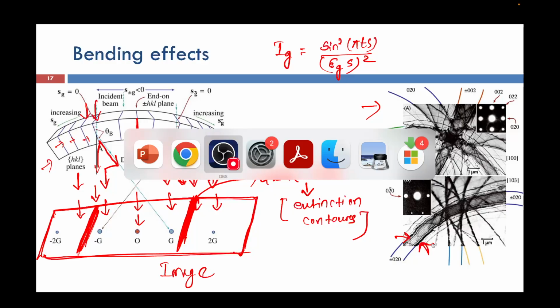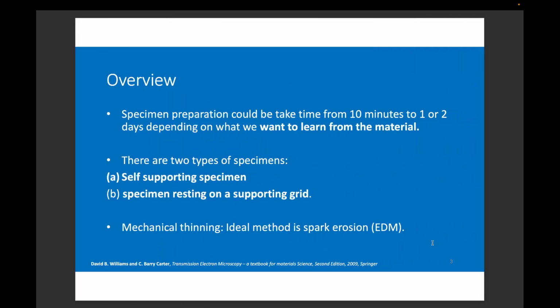Sample specimen. Okay, so now coming to the sample specimen, the specimen preparation for this TEM, because that ultimately determines what type of image we are going to get. So there are two types of specimen preparation.